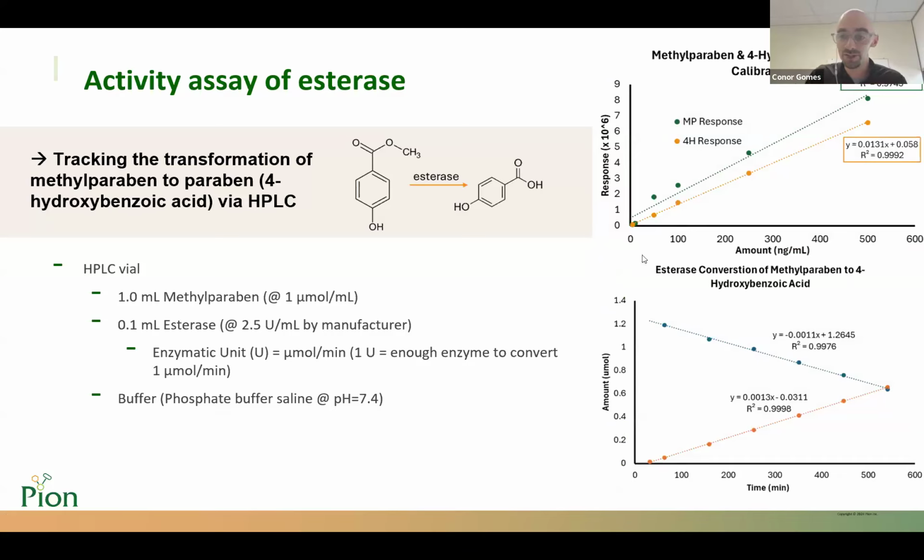The establishment of this assay meant that we were able to qualify the enzyme's activity in all stages of the SCISSOR ECM manufacturing and implementation within an assay.